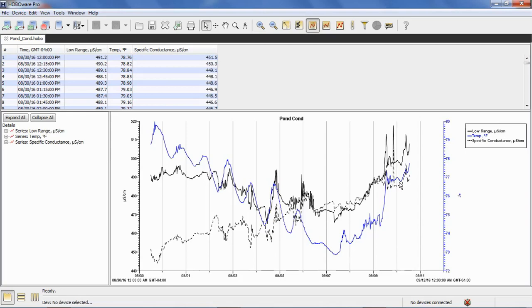And again, this is most likely due to there being a lot of organic material in the water at this pond. However, this could be an indication of pollutant runoff as well. We're not exactly sure. We believe that more water quality testing should be done with some other instruments. We do know that some wells were tested in that area, and they tested for elevated levels of dioxin.